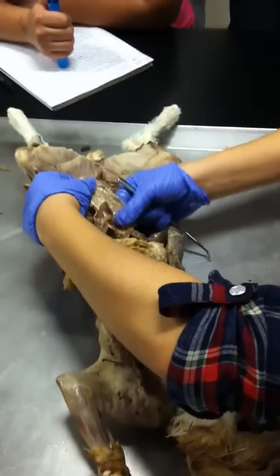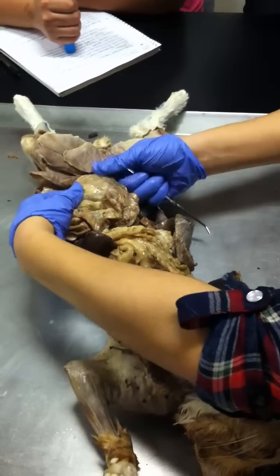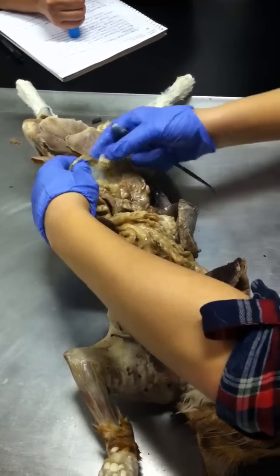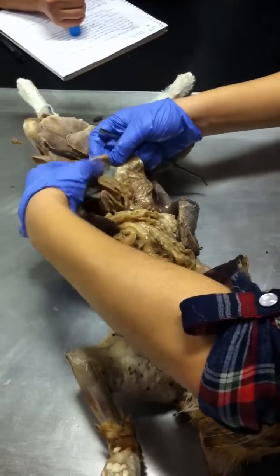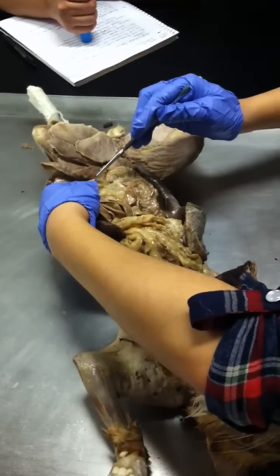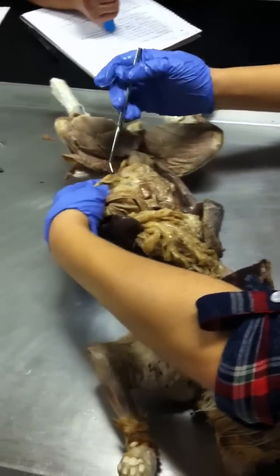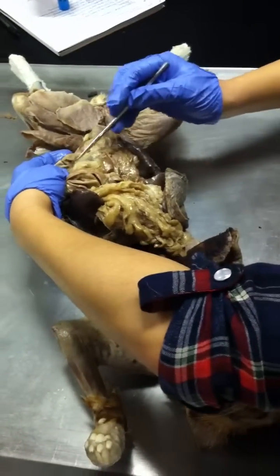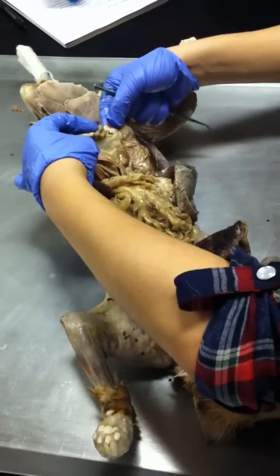So see how this right here, do you guys sort of see this? This right here is the ascending colon. This is the large intestine, and see how this right here, see how the tube is smaller? Right? That's the end of the small intestines. That's the cecum. What's it called? The cecum is the beginning of the large intestine, right in between. Well, the cecum is right here.